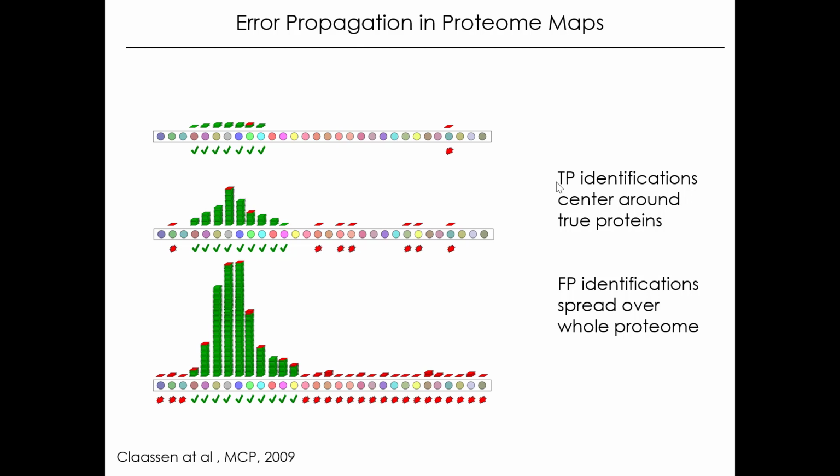So when you do this once or with two samples, this represents the proteome, say 20,000 ORFs, and you will identify a number of proteins with a false discovery rate of 1%. So this is quite accurate, and I think we are all very confident that we can do this well. I'll come to the DIA issue in just a second. This is the DDA situation. But now let's say we do it another time, and we do it 100 times.